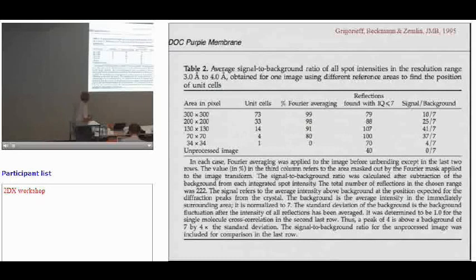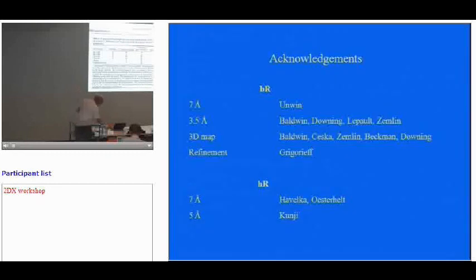So what that's showing is that 14 unit cells, about 1.5 megadaltons worth of reference, was optimal for the 2D crystal. But when you try and do it with 1 unit cell, which is basically 100 kilodaltons, and it's very strong because it's got all those helices, it's on the edge of being impossible. And I think the single particle images are not nearly as good as the 2D crystals, which are on thick carbon. And so for single particles, and this is what I thought I'd chat about this evening, we really need proper validation criteria for small things, say up to 1 megadalton.